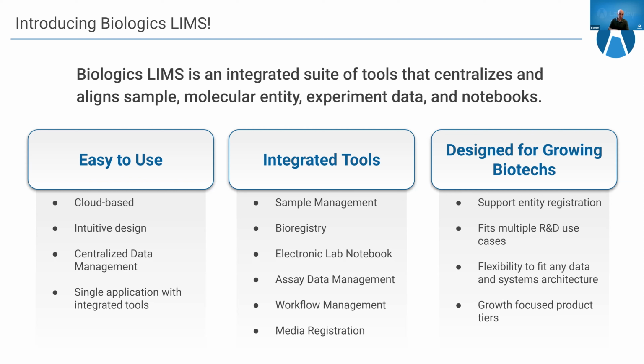Then there's governance and access controls. This is really two main components. So at some point, right now you may just be 5 people working in a lab, but at some point you're not actually going to want everyone to see everything. With limited exceptions, you will need a way to organize your data and impose a permissions model based on your business needs or other incentives. That's security.